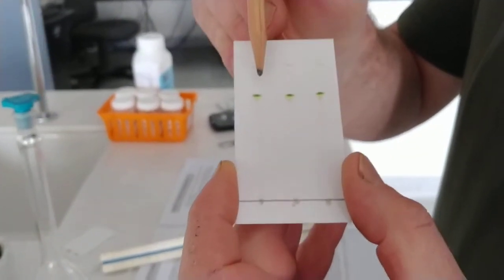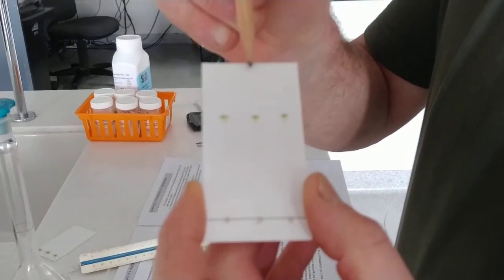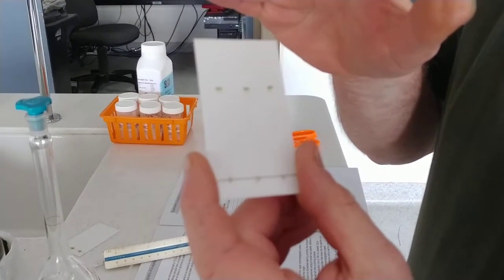Now, what we have here is the chlorophyll, and this looks like the carotene up here. If we kept going, we'd probably get another separation, but these plates are only that high, so we probably need a plate that's about another 40% longer.